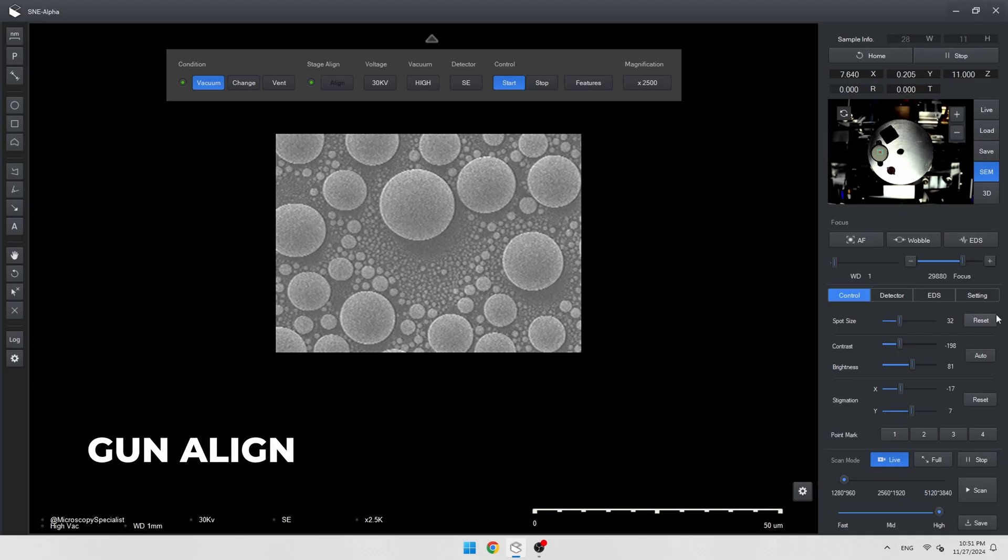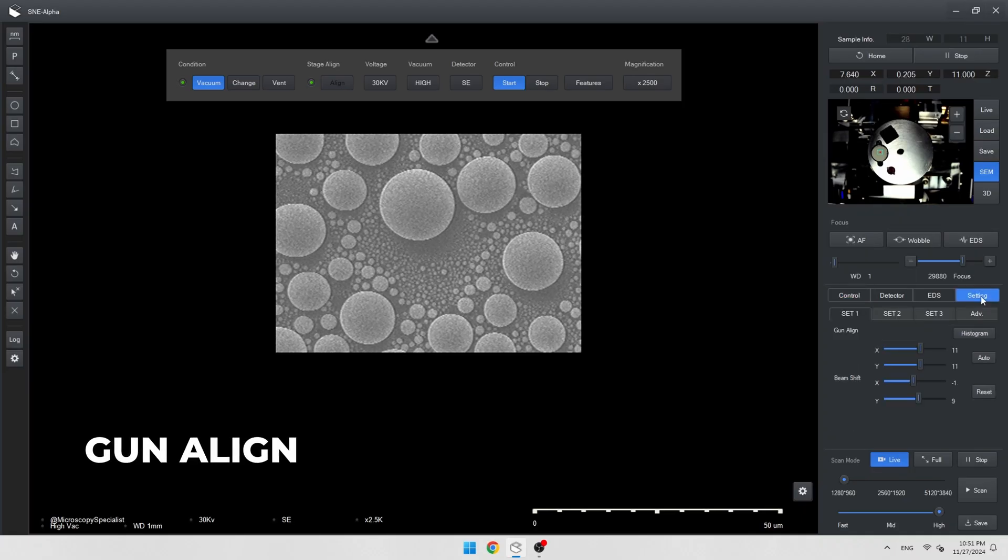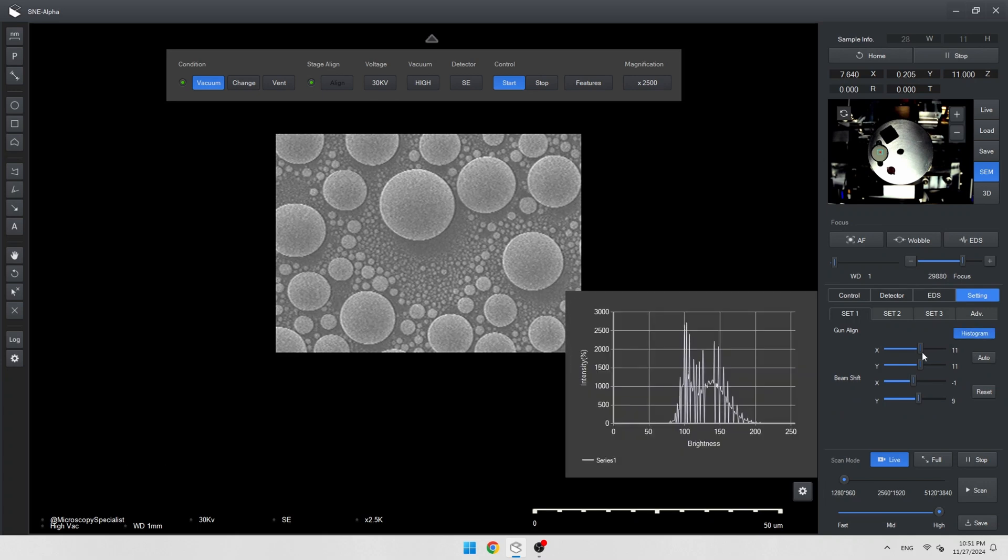Okay, let's adjust the beam. We need to align the beam to increase the intensity. We can check the histogram for better alignment.